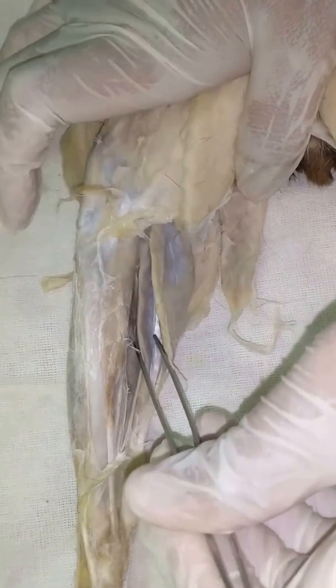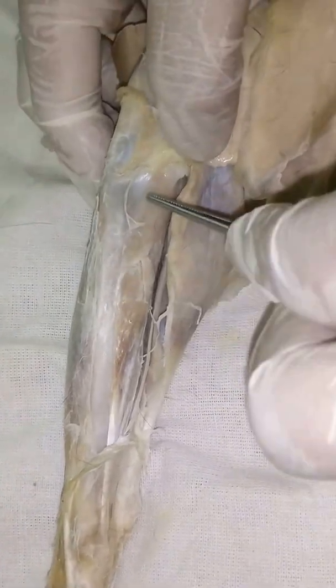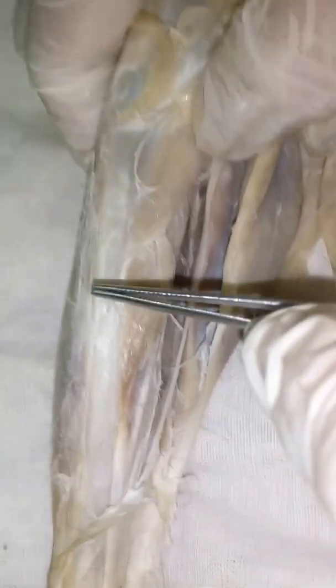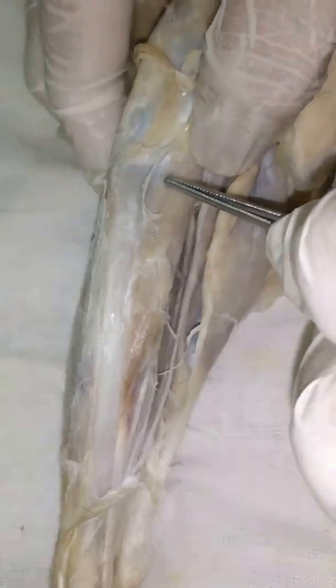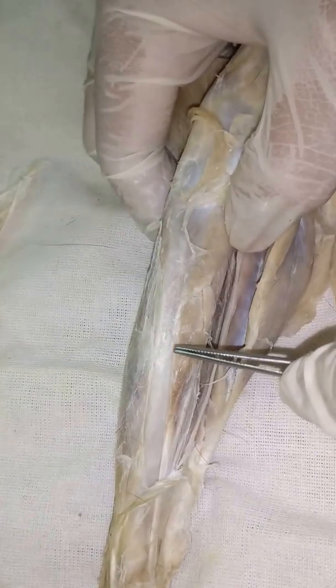Now let's go to the last one — the shank. The most famous one: gastrocnemius. Let's go first to the ventral side. Underneath the gastrocnemius is the plantaris muscle. You'll notice these are actually two separate muscles — this is the popliteus muscle, and this is the flexor digitorum longus. It's a flexor because it's on the ventral side.